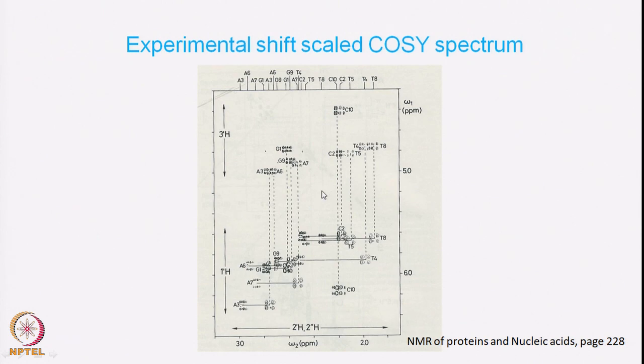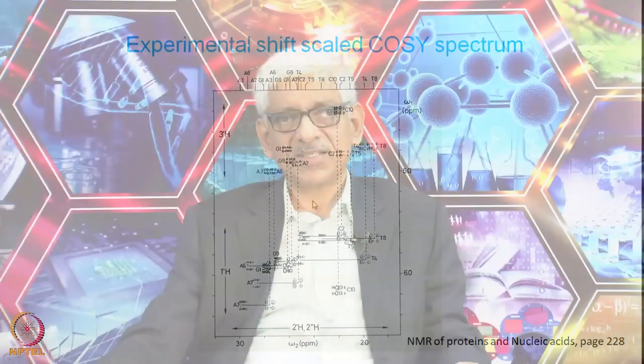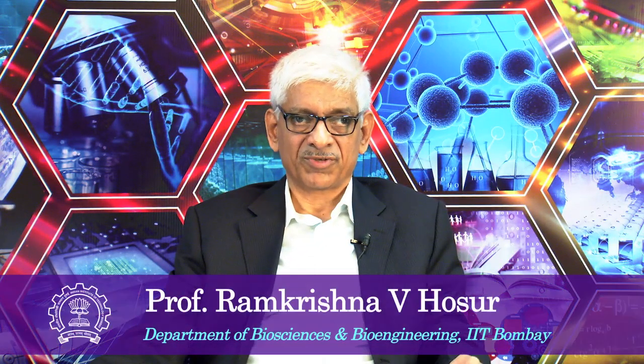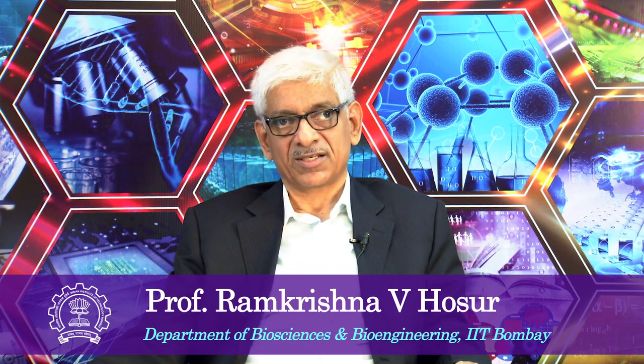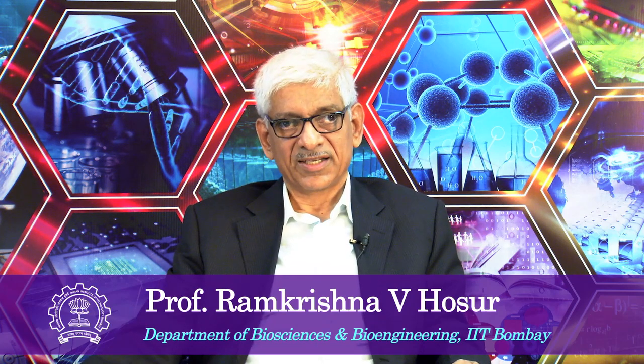So this is the application, and we will see later how to increase the chemical shift appearance in the spectrum, that is, can we make the chemical shifts enhanced or scaled up. So we will see that later, and so with that we will stop here.